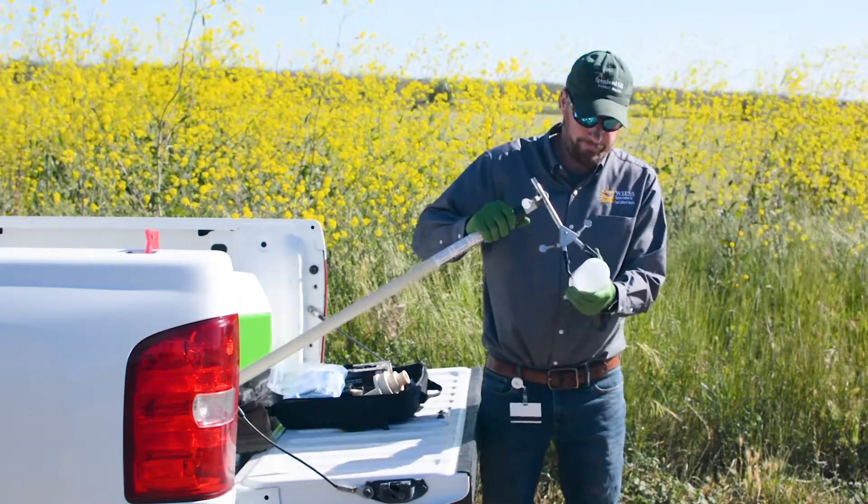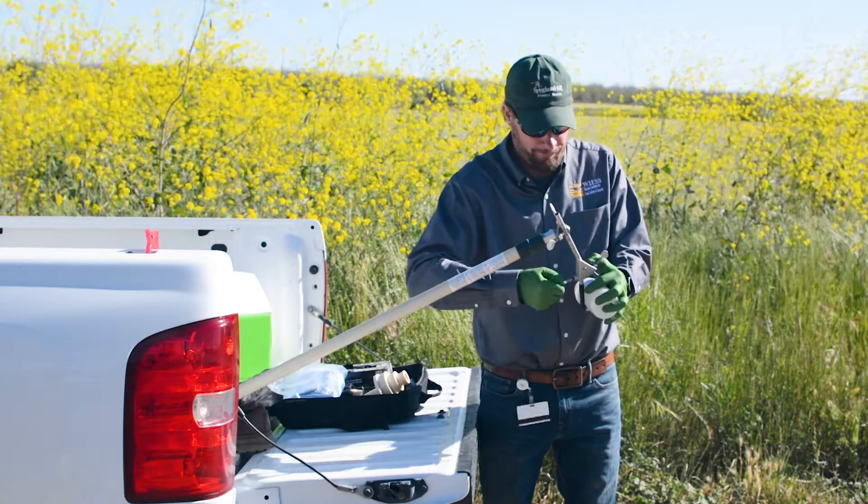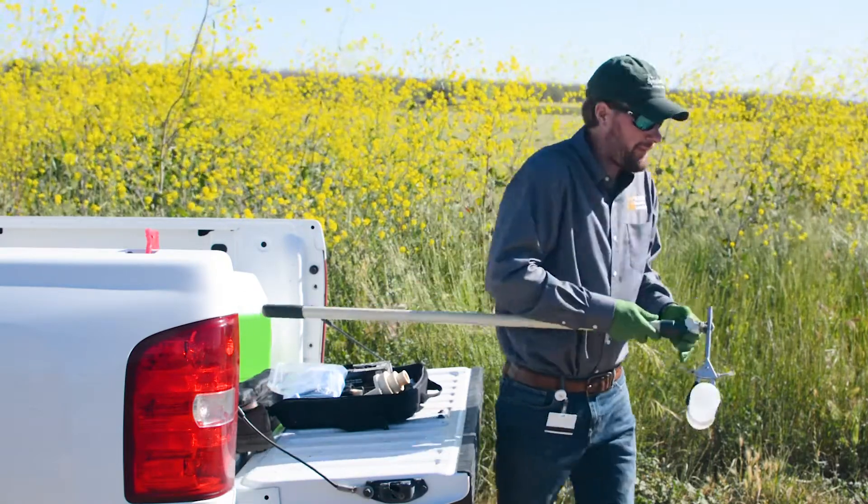When using a pole, attach the bottle firmly using the attached clamp. Check that the clamp is tight around the bottle so that it doesn't detach while you are sampling.